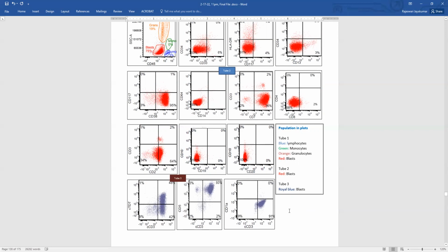Maybe these are a little in the next stage, which is why CD34 and CD10 are negative. CD4 and CD8 are both negative in these cells. In cortical thymocytes we have two stages, double negative and double positive. The double negative stages usually do not have surface CD3, and the double positive stages have surface CD3. So all of these match.